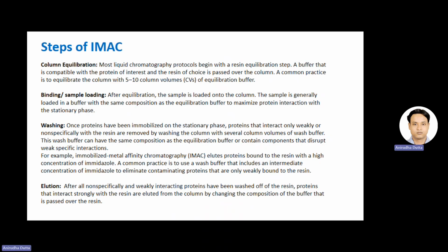The next step would be binding, or sample loading. Sample loading is done where the protein, in the same buffer as the equilibration buffer, is loaded into the column. Okay, and let it pass through the column.